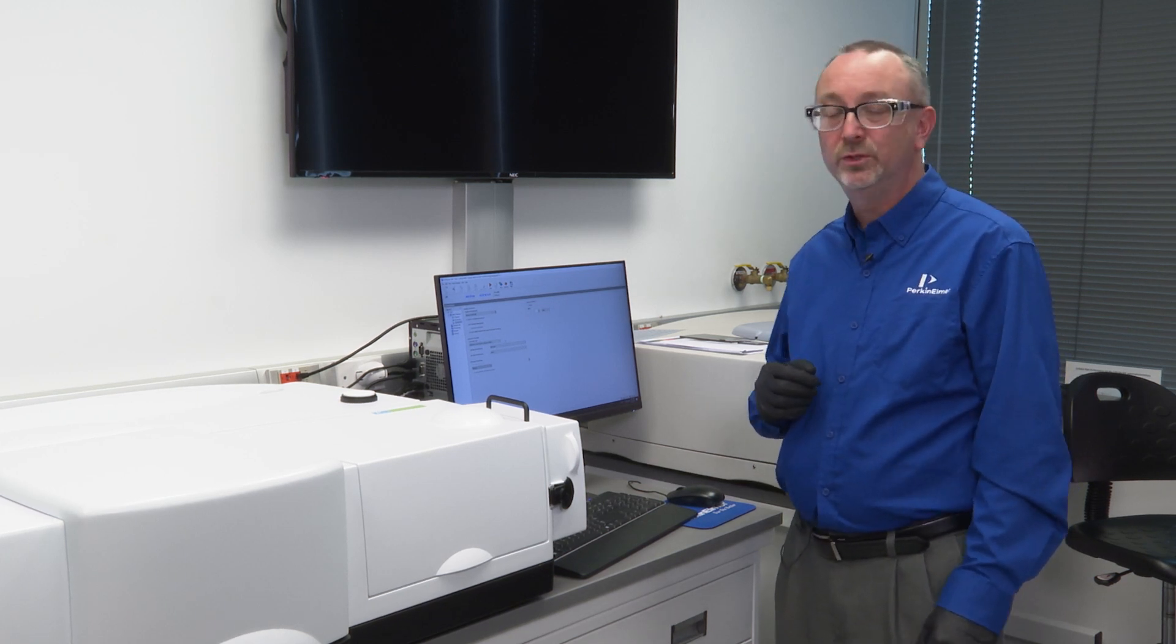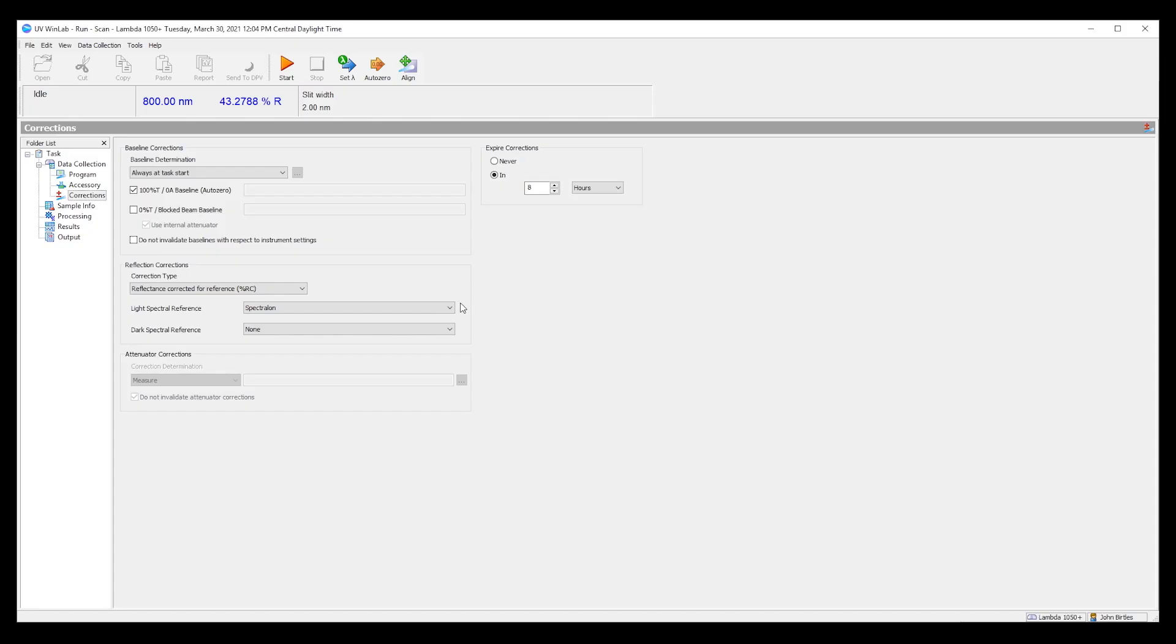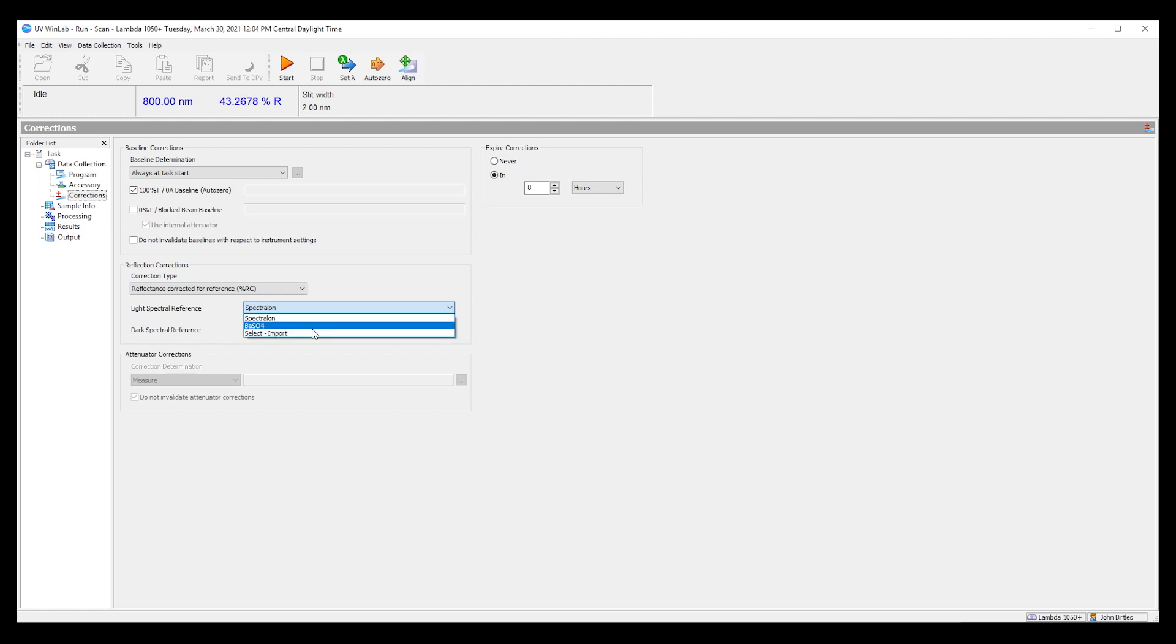What one should do is input via the import button the correct correction file for their specific material which will be slightly different. Not by much but it can be critical. So select input would be used for specific calibrated traceable materials.